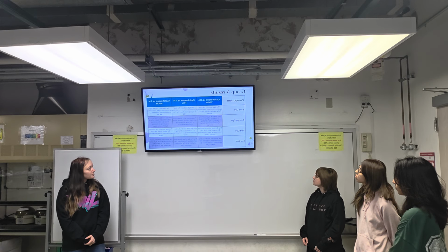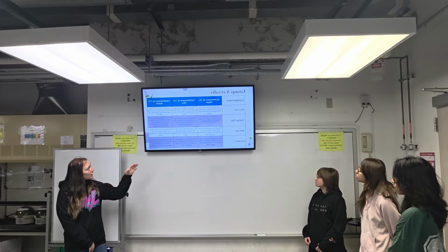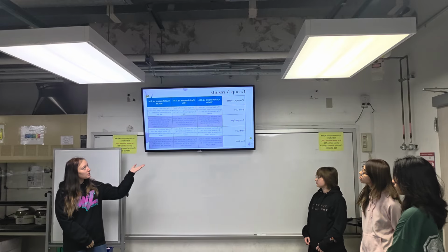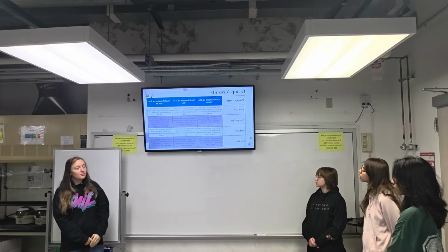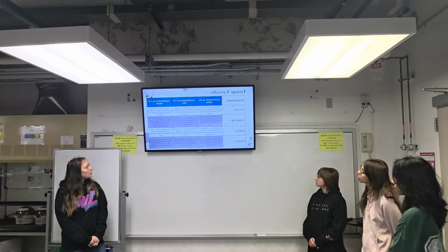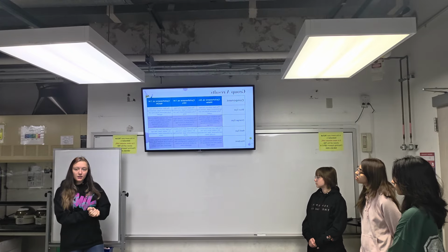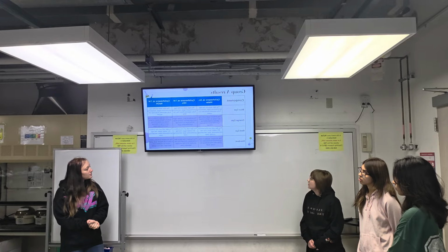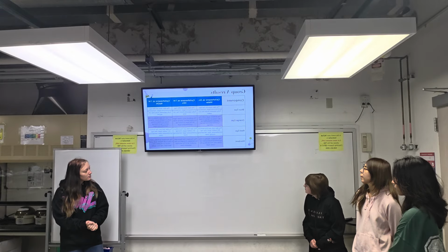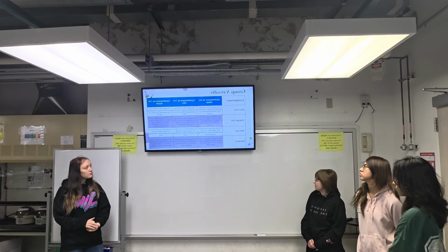For red dye, we found the dye mostly rests on the bottom layer, which changes throughout each. The first one's DI water, the second one's 1M HCl, the third one's 1M NaOH. And it remained mostly clear, except the DI water had a little bit of running, but it was still mostly clear. And then for the mordant, for the first one, it remained in the cyclohexane, it didn't cross with the DI water.